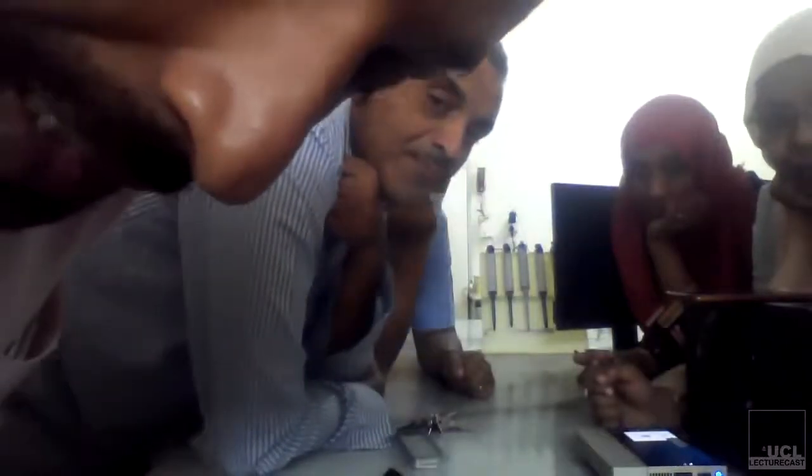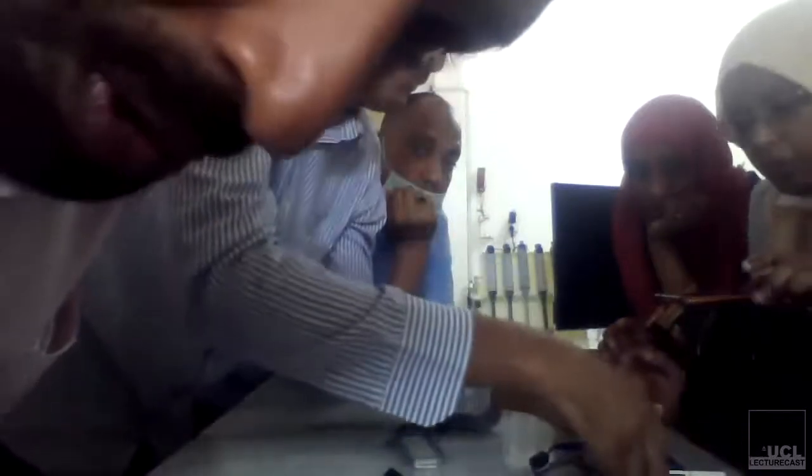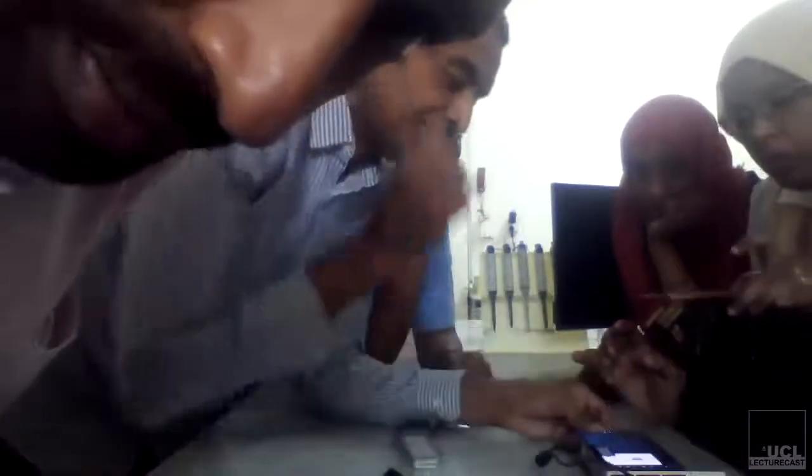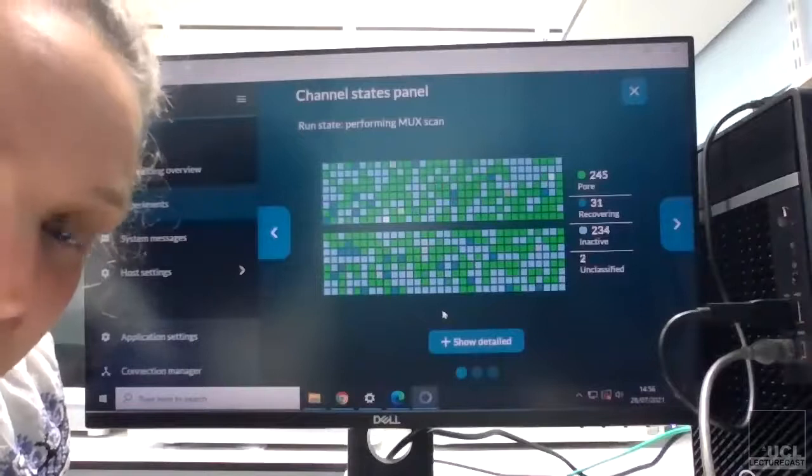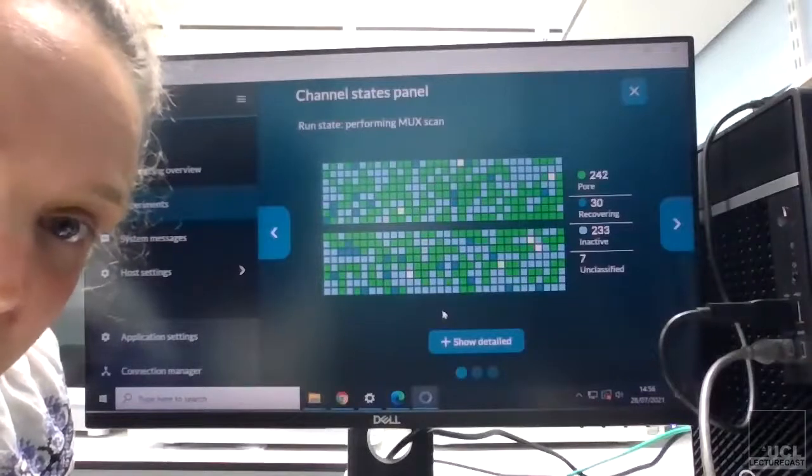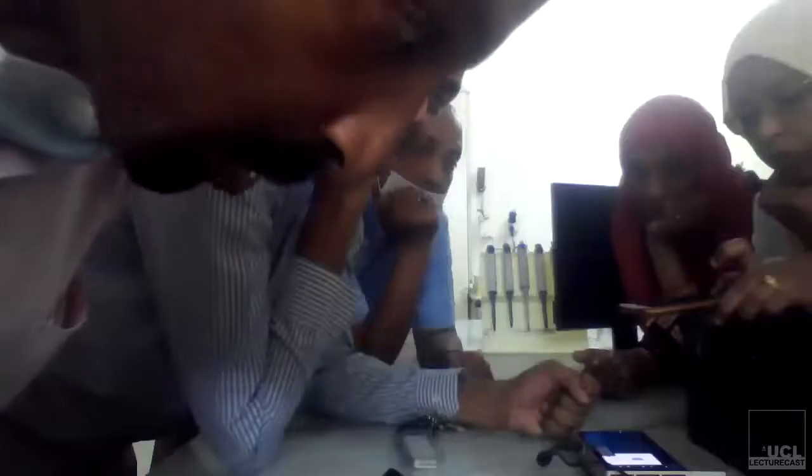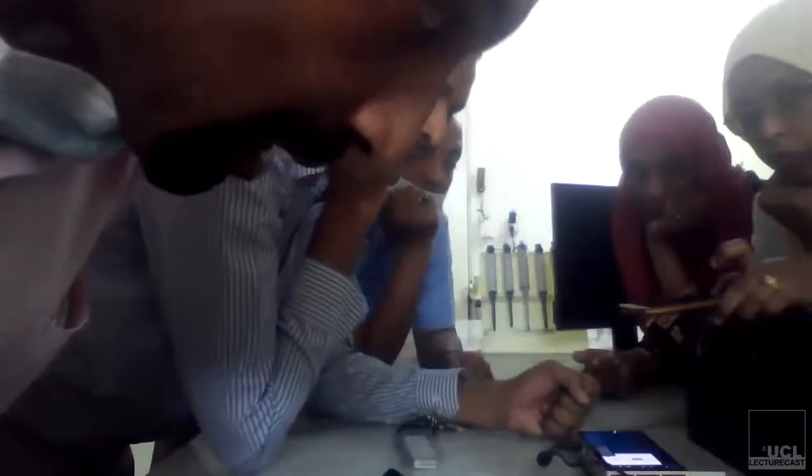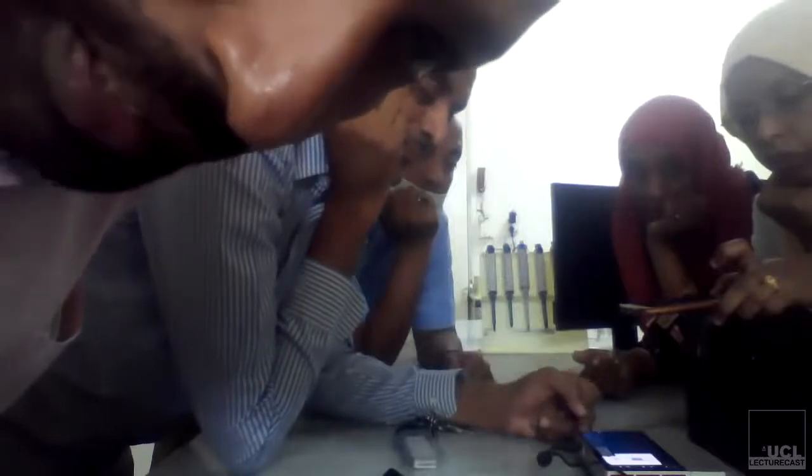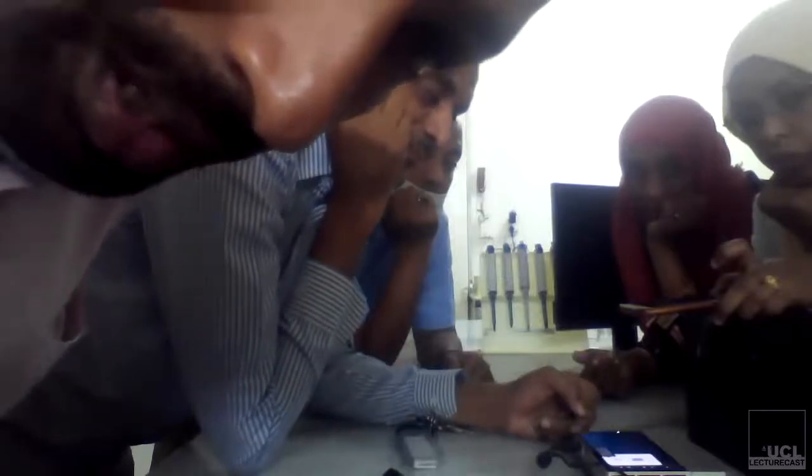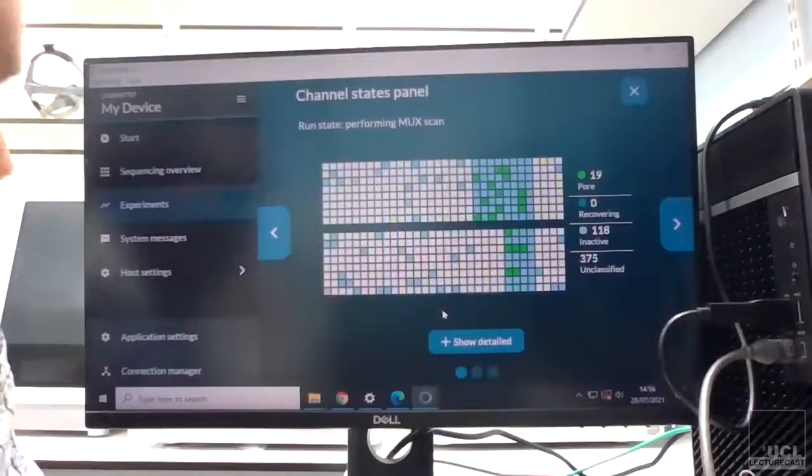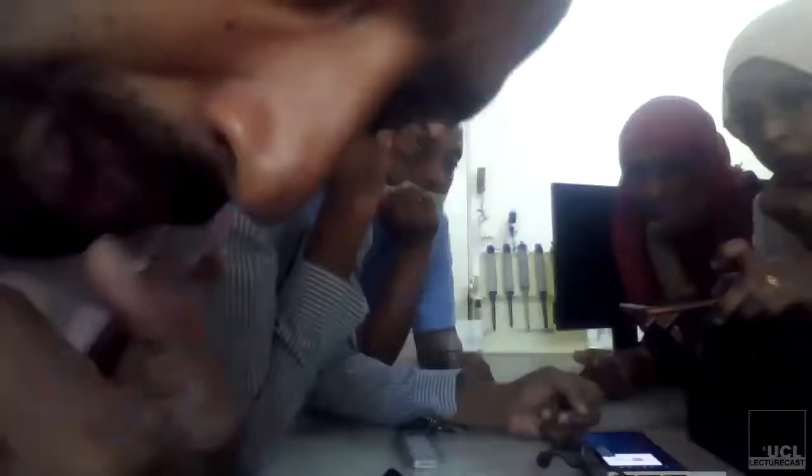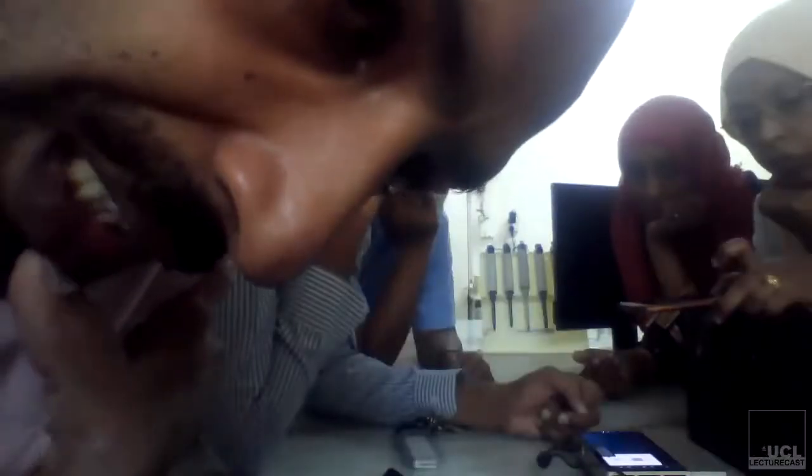Lindsay, would you please have a look at Hannah's device, at Hannah's screen? We already finished our quality check and we found like 700 pores. Okay, it's less than 800, so yeah, that's less than 800, so you should be able to ask for—do we need to repeat this again, this quality check again for the same flow cell?